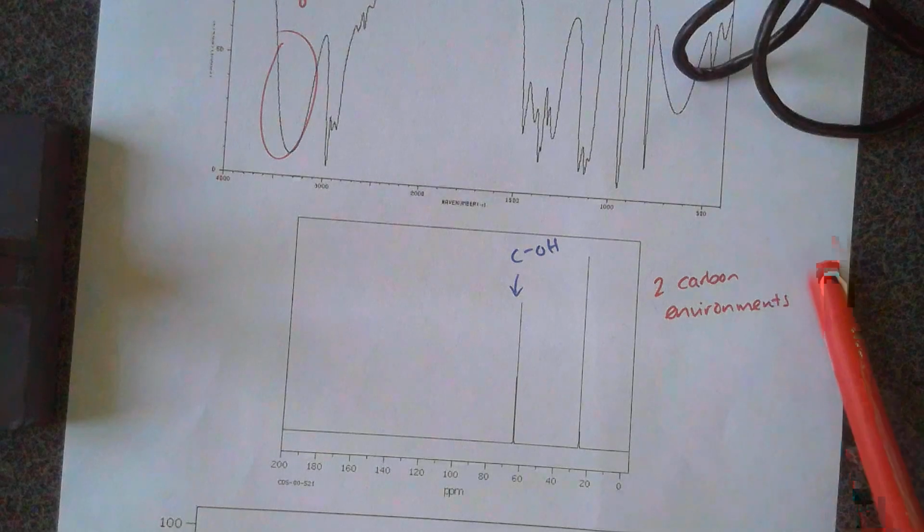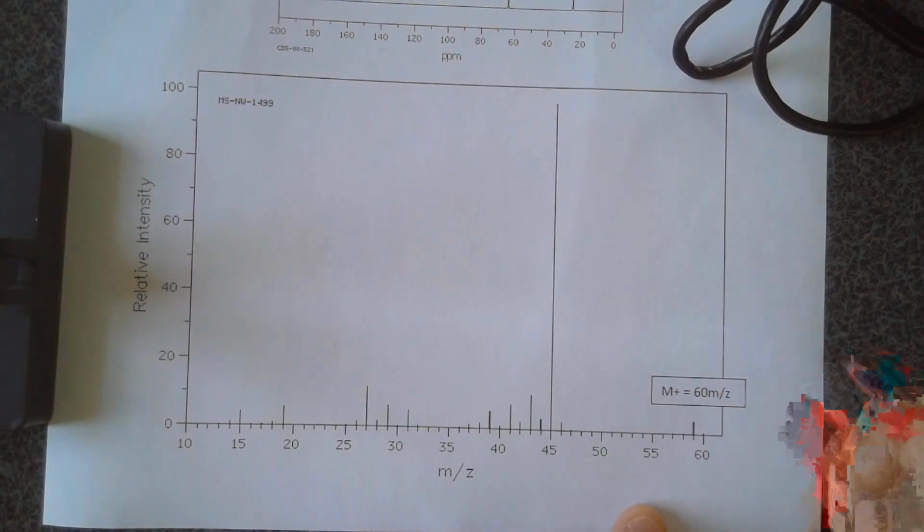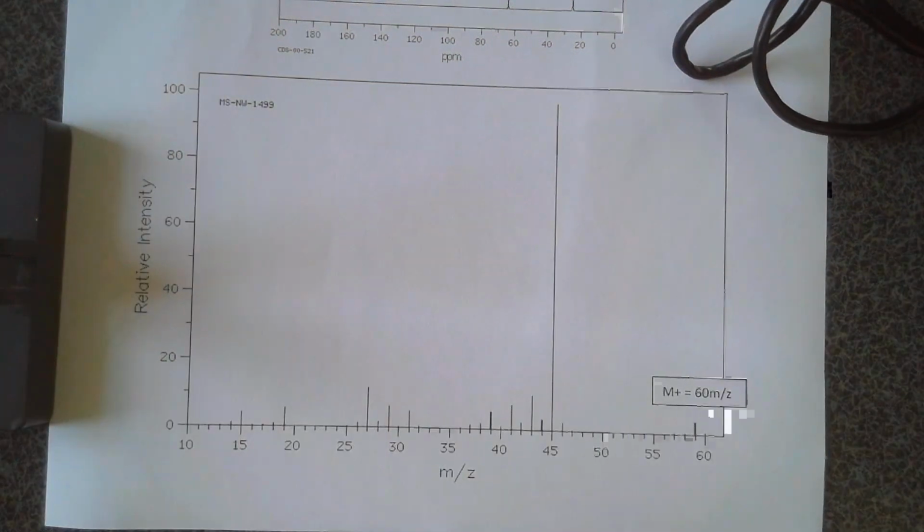All right. So for the mass spec, let me talk about what you need to do for the achieved. For the achieved, I just need you to tell me bare bone basics. Which one's the base peak? Which one's the molecular ion? So molecular ion, I've actually labeled it because it's super tiny. It's very hard to see it.